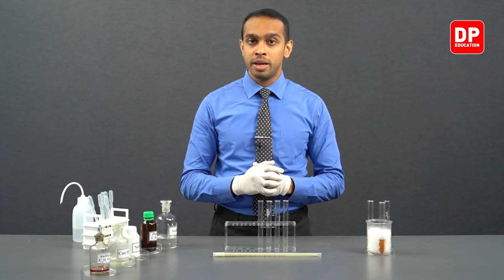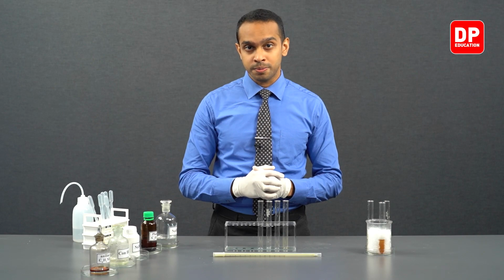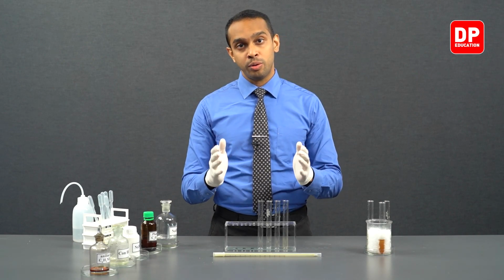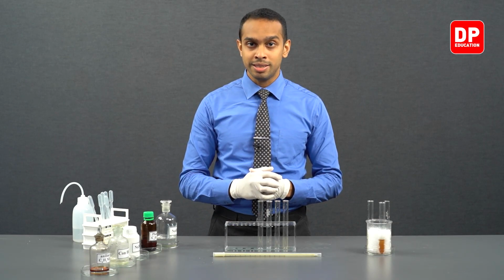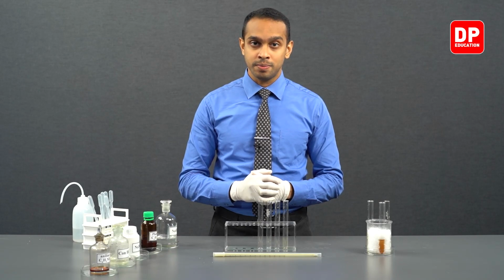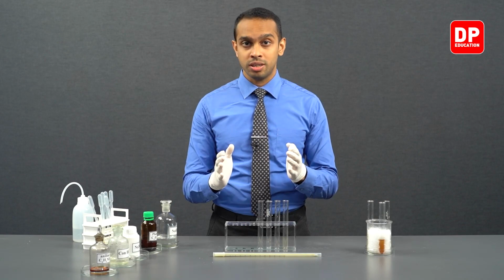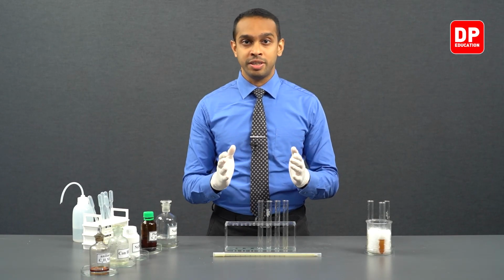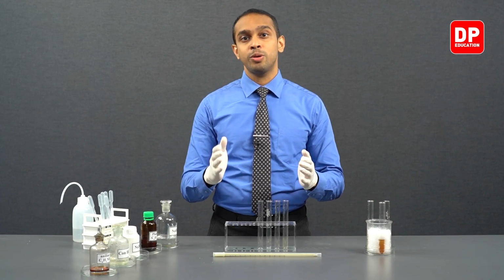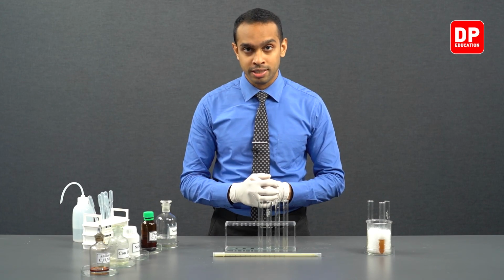This is also referred to as an aromatic benzene diazonium salt. Benzene diazonium chloride or aromatic diazonium chlorides are more stable than aliphatic diazonium chlorides. However, if the temperature is not kept between 0 and 5 degrees, at higher temperatures, this benzene diazonium chloride will turn into phenol, nitrogen, and hydrochloric acid.